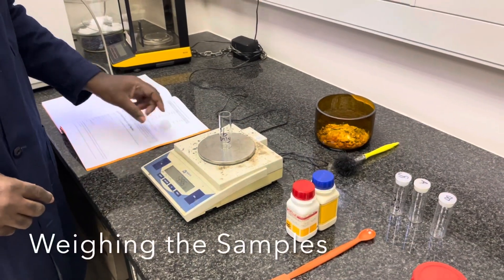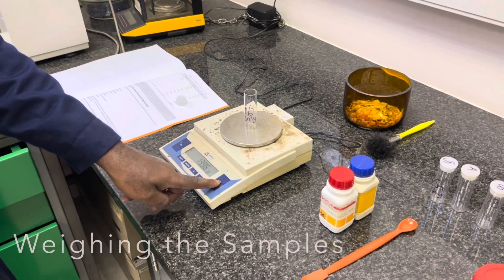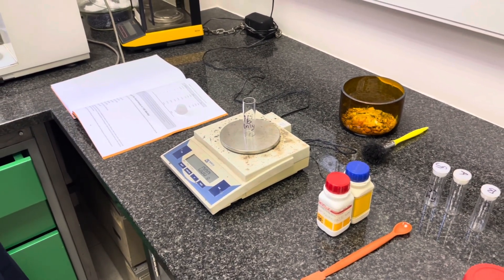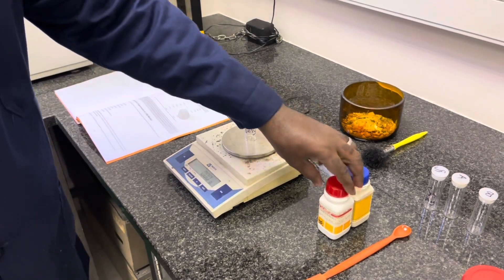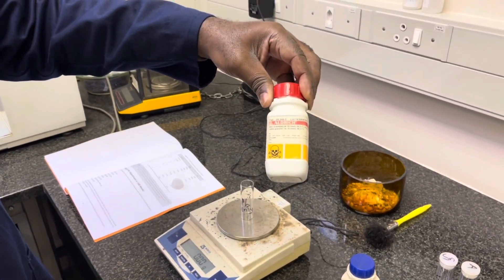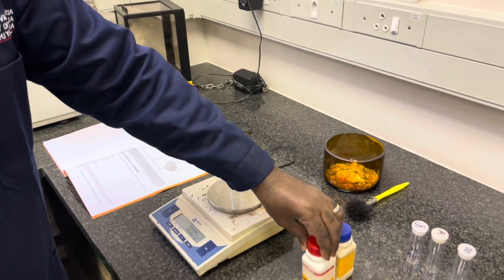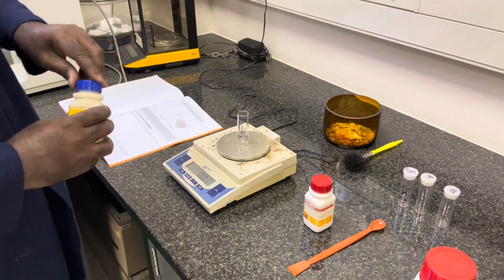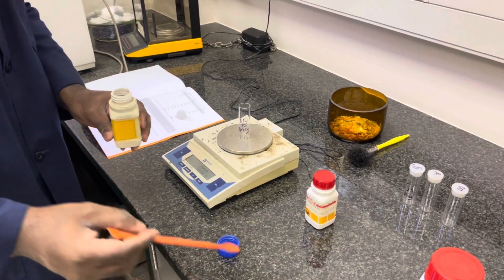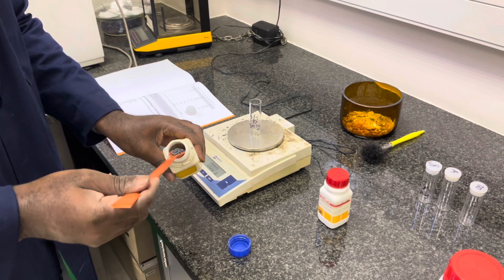Next we need to prepare the samples of lead and tin as described in the practical manual. We will start with the lead only sample. For the lead and tin only samples, you can directly use the polytops provided and simply weigh off the appropriate amounts of mass as described in the practical manual directly in the polytop, as we will now show.